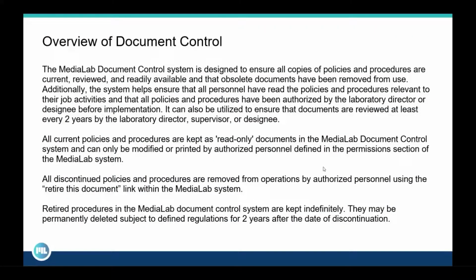Document Control with MediaLab is designed to ensure all of your documents have been reviewed, they're current, and readily available to your employees with the appropriate access. The system helps to ensure that these documents are relevant to your employees based on their job duties and that they have been authorized for approval by the CLIA lab director or designee before they are available to those employees.